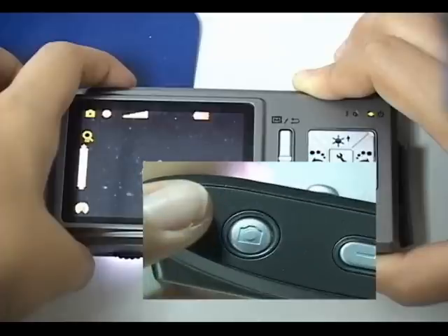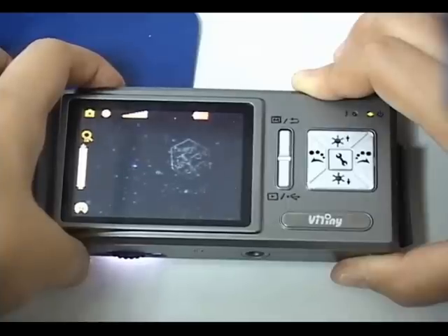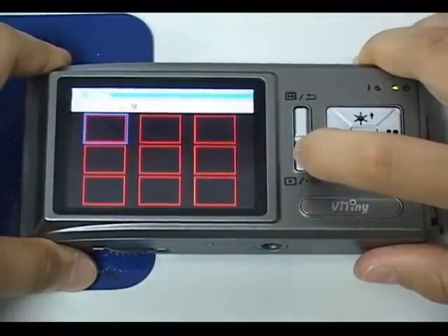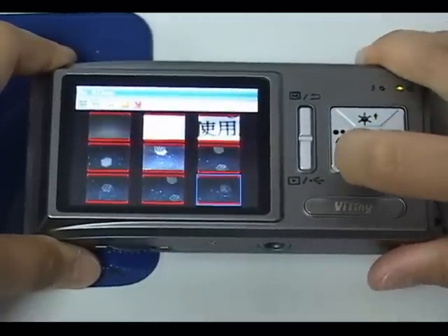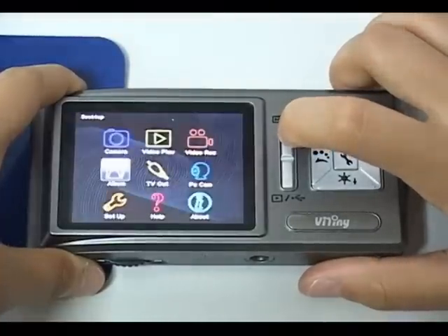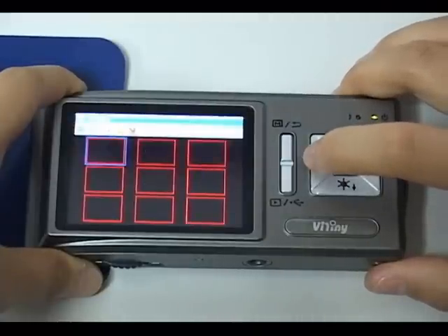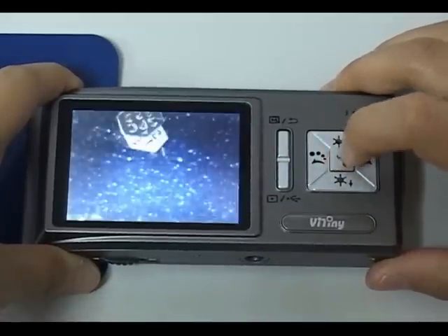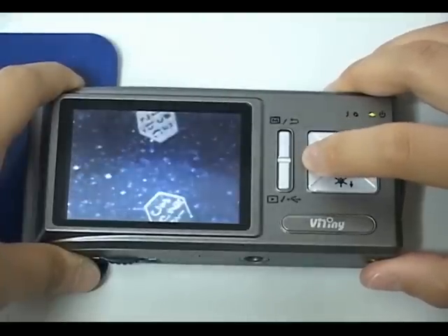Press Capture button to capture objects into an image. Press Preview button to preview the captured image. Press Selection button to go into Menu display and select Album to see all captured images. Click Bottom button and Middle button to start previewing an image. Click Bottom right button to see the next image, and Bottom left key to see the previous image again.